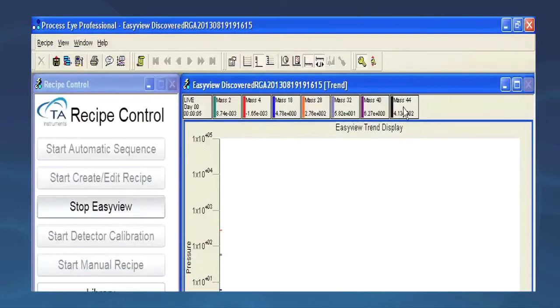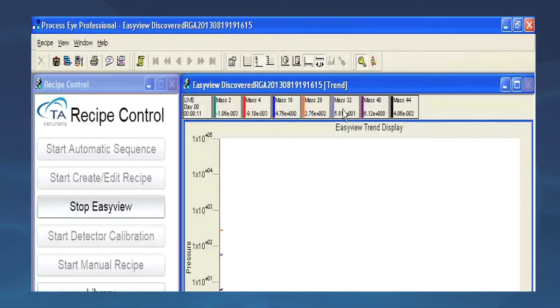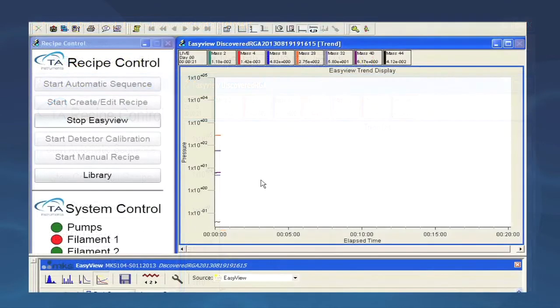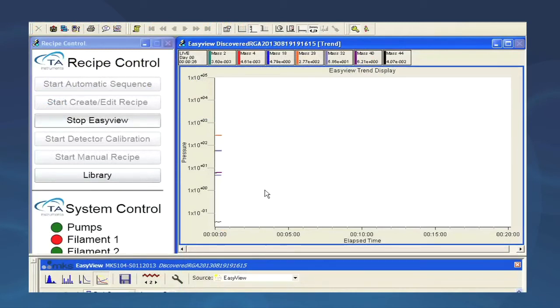Mass 44 is carbon dioxide, mass 40 is argon, mass 32 is oxygen, mass 28 is nitrogen, mass 18 is water, mass 4 is helium, common carrier gas, and mass 2 is hydrogen. You will see these plot as a function of elapsed time and within a few minutes you will have a representation of the relative concentration of each of these gases.